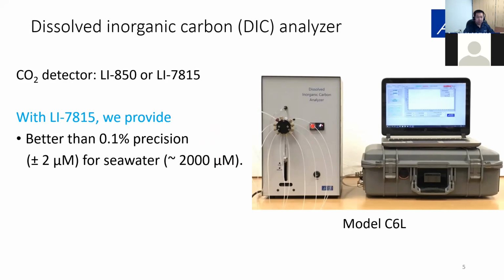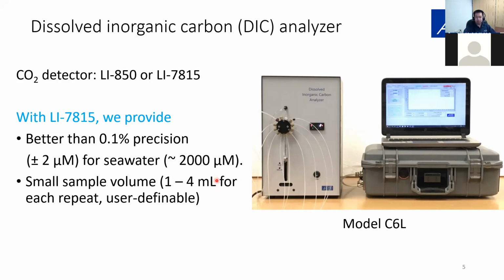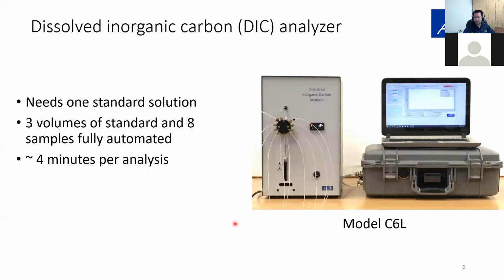And what you see here is a multi-sampler. There's a 12-port valve here. 1 port is dedicated to standard, and 8 ports are for samples. The sample volume is between 1 and 4 mils for each repeat, and this number can be changed by the user.